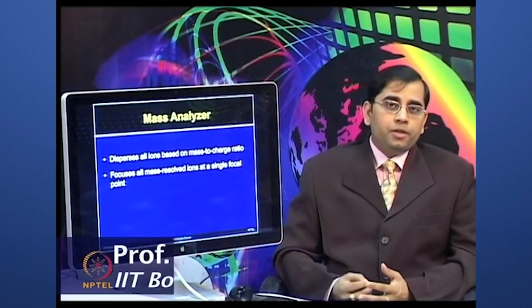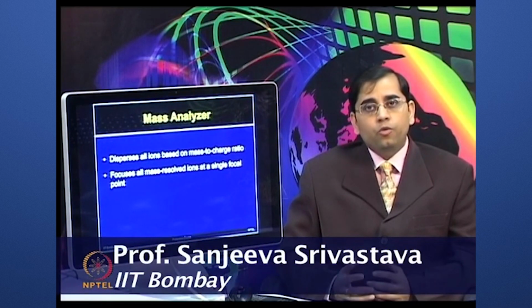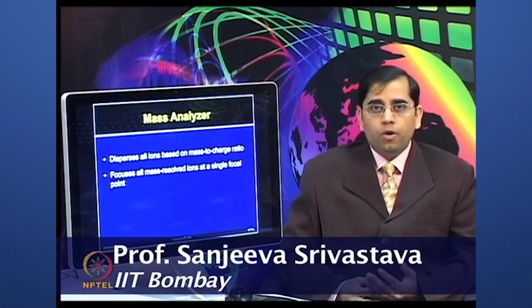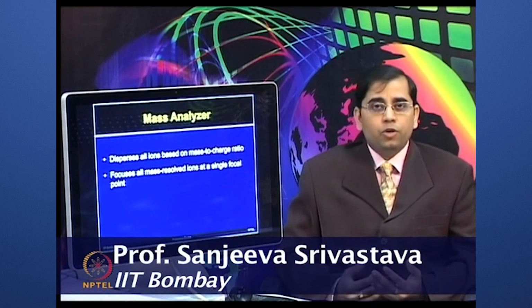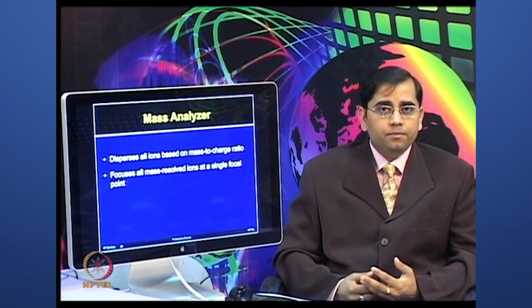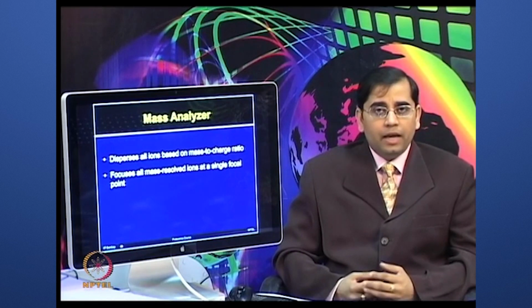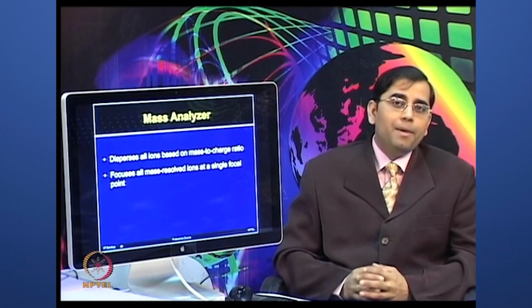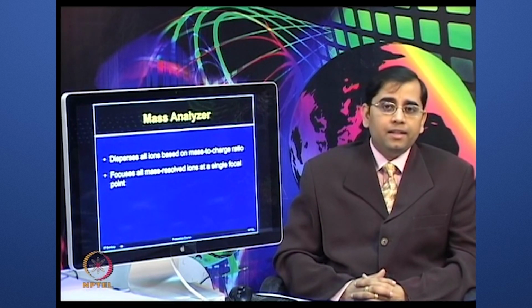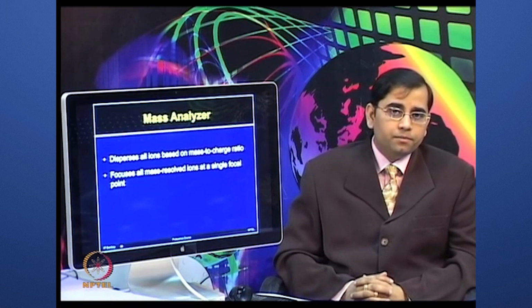So, we are talking about an MS experiment and I am trying to give you an overview of various steps involved. First of all, we looked at liquid chromatography based pre-fractionation, in-gel digestion, and different types of ionization sources. Now let us move on to the mass analyzers. A mass analyzer plays two most important functions.